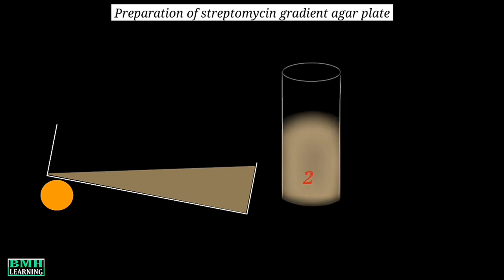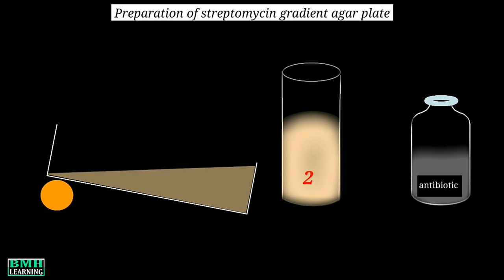We then take the second tube with molten agar along with our streptomycin solution. Using a sterile 1 ml pipette, 0.1 ml of the streptomycin solution is added into the second agar tube. The tube is rotated so that the antibiotic solution can be mixed with the agar, but you need to avoid making any bubbles.